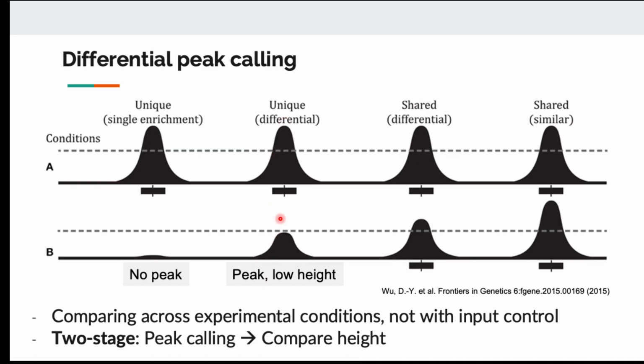So you might have an upregulation of the transcription factor, so you have more molecules of transcription factor. In one condition, the transcription factor only binds at a certain frequency. But when you have upregulation of the transcription factor, you have more binding. So you can have a differential peak height as well. You see a peak in both conditions, but the heights are different.